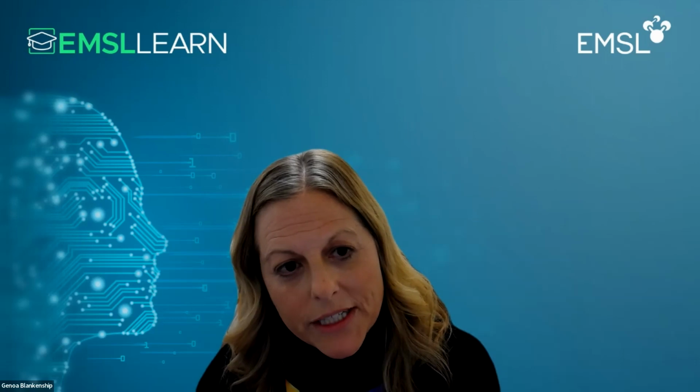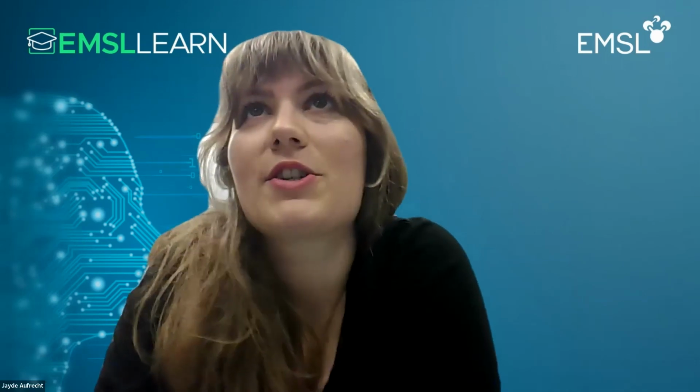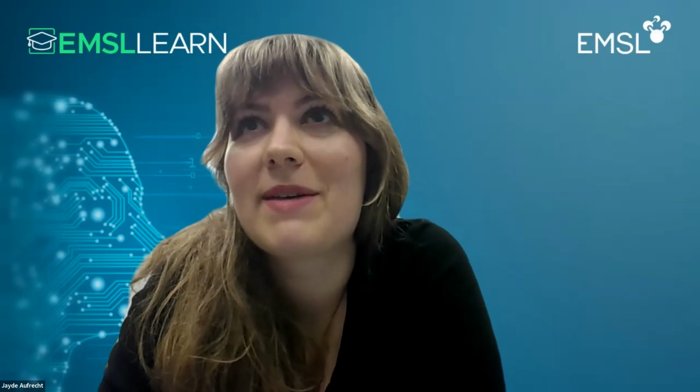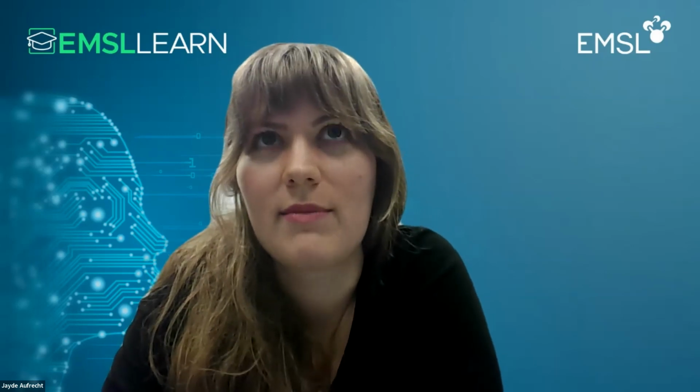Another question from Tina. For MPLEX, are there any barriers for bringing or sending soil from outside the United States for this integrated analysis? That might be a question for more of our MPLEX team than me, but from what I understand, we do have international users, and as long as it meets USDA requirements and is not radioactive, we should be able to receive soils. It might just be a few extra paperwork hurdles to jump over.